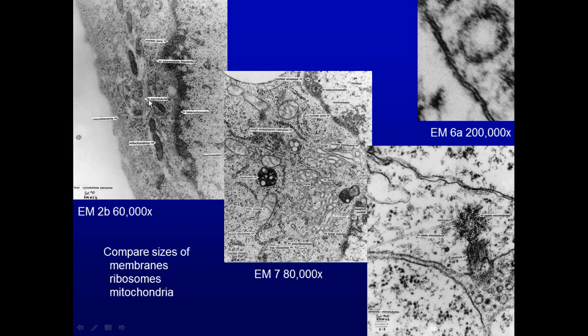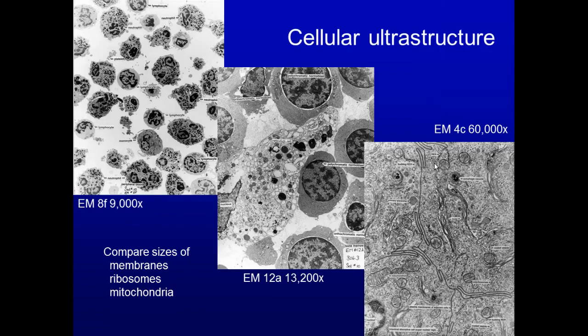And here we can see microtubules. Microtubules here free in the cell. And then these are the microtubules here. And so are these. These are microtubules of the centrioles. And these are labile microtubules that are attaching to the centriole. See the difference in size in this thing and that thing? Where the magnification has increased there. So the magnification is important. Is it low mag, high mag, what you can see.